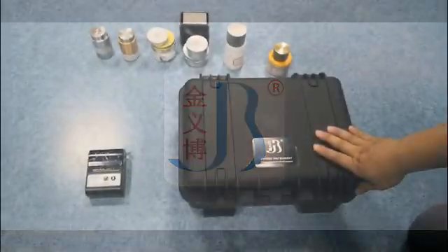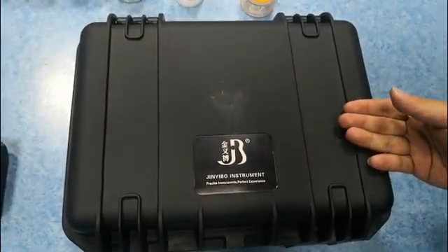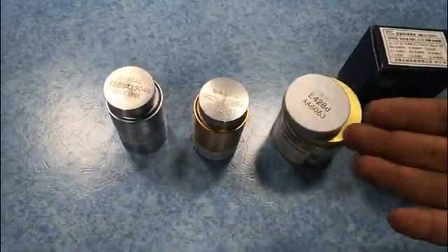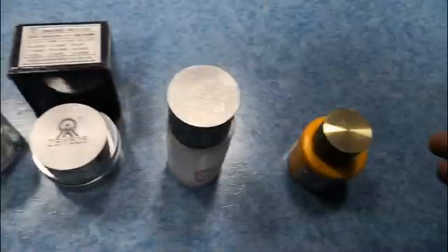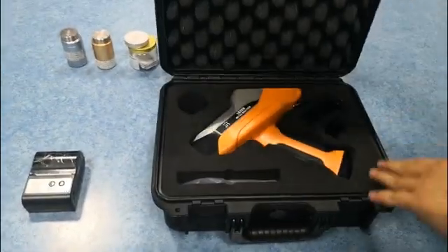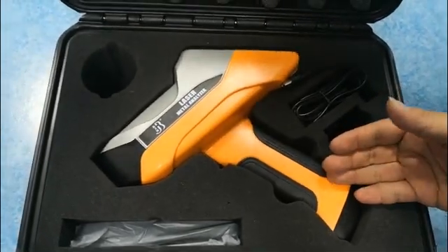Today we will introduce our laser metal analyzer. This is our LIBS — these are the printer, these are the standard samples we will test today. Now we open the box. This is our laser metal analyzer LIBS.